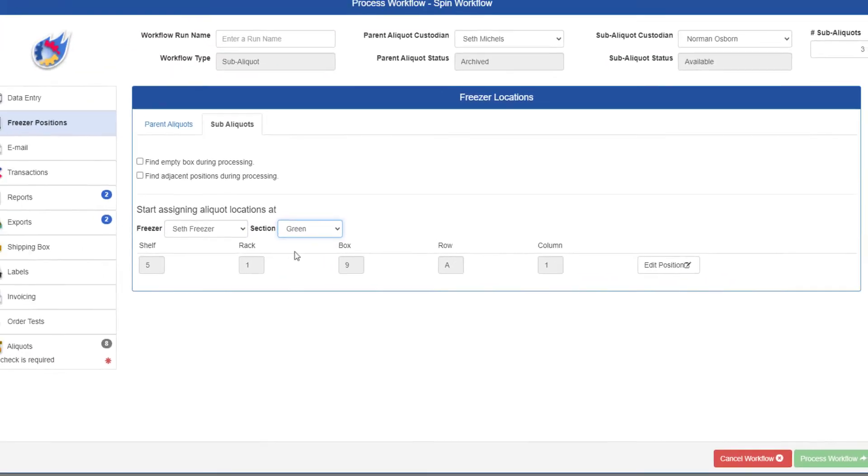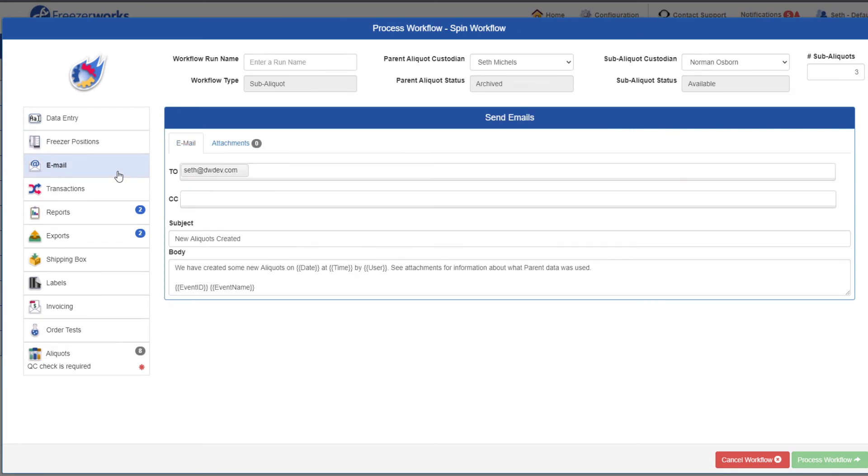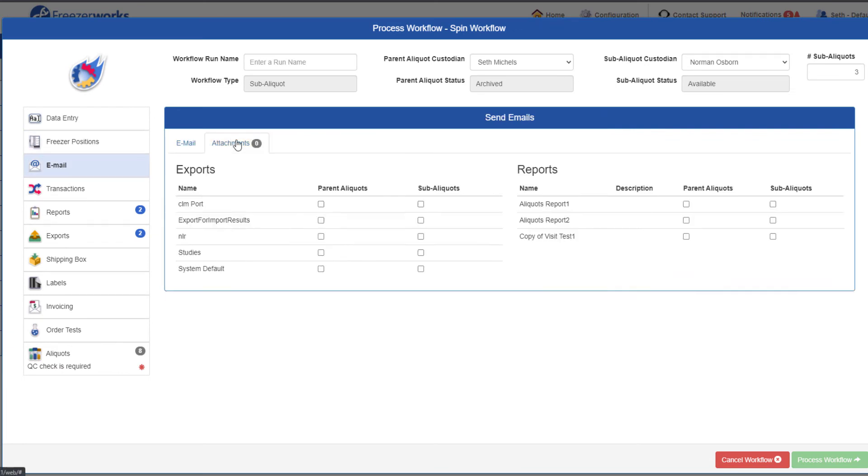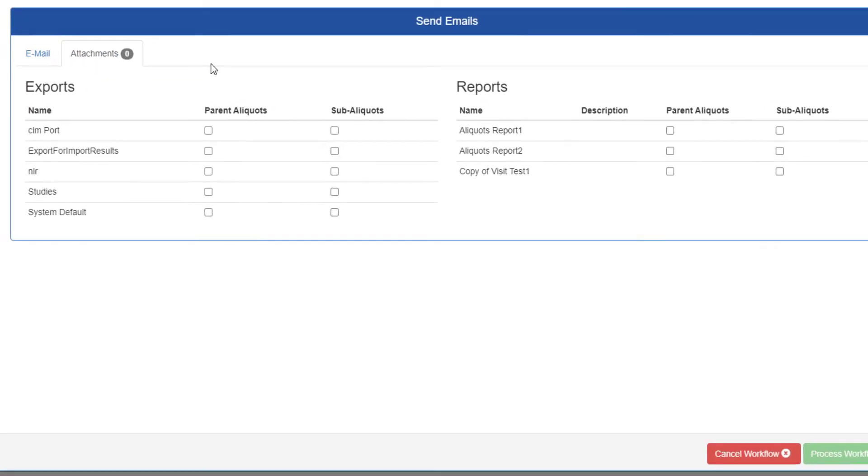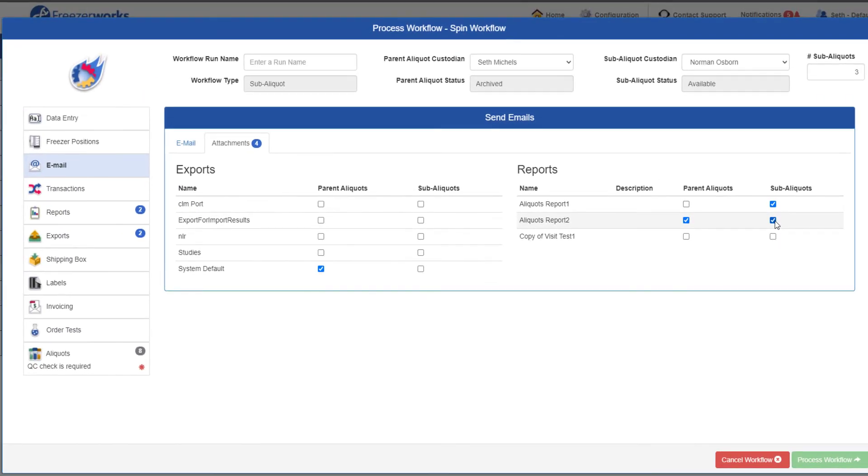Moving right along, the email page will look just the same until you go to attachments. Here, you can decide whether you want to include exports and reports for the parent aliquots, the sub-aliquots, or both. That's all there is to this page though.